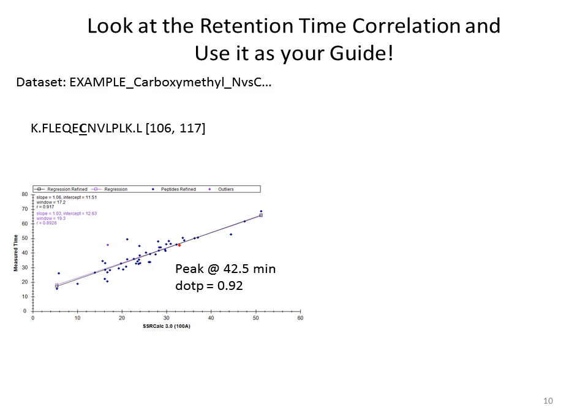And that can be calculated, again, a little bit rudimentarily, but it gives you an idea: things with a low hydrophobicity score will come out earlier, and things with a higher hydrophobicity score will come out at a later retention time. And then you can draw a regression through all those data points, and you tend to see something that kind of looks like a line.